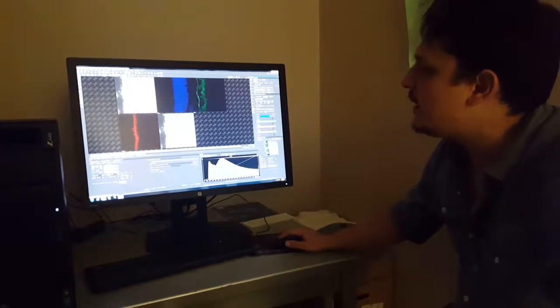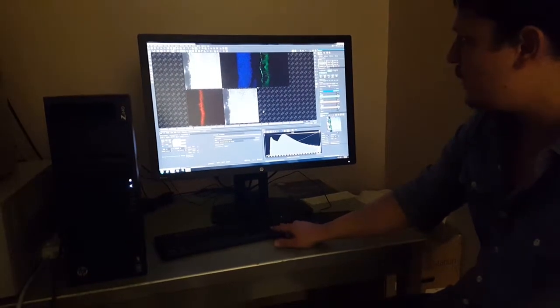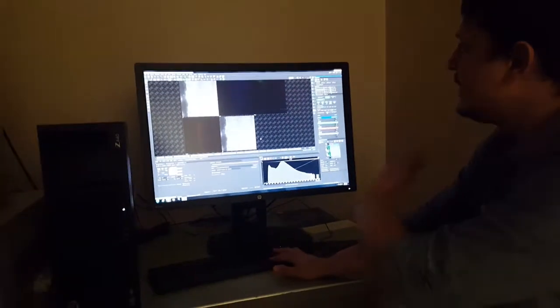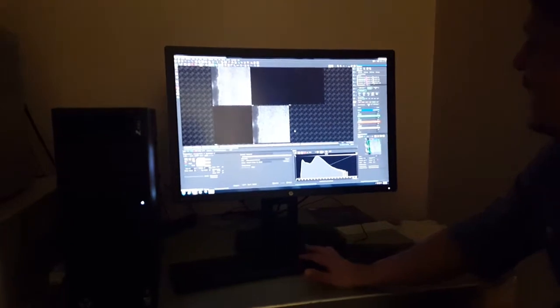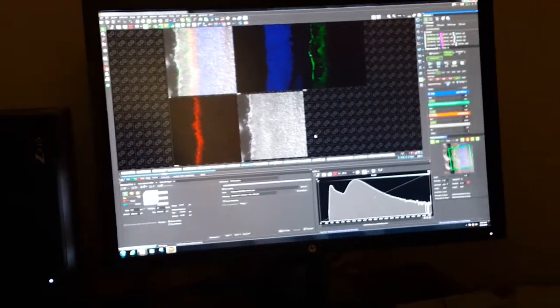So now that we have the image scan, we can move with the arrow and we can make an entire view of what we scanned. And in this moment, what we want to do is to set all the images in the same position. So we can rotate, and here before taking the picture and putting it straight, but what we want to do now is go to image and rotate it.